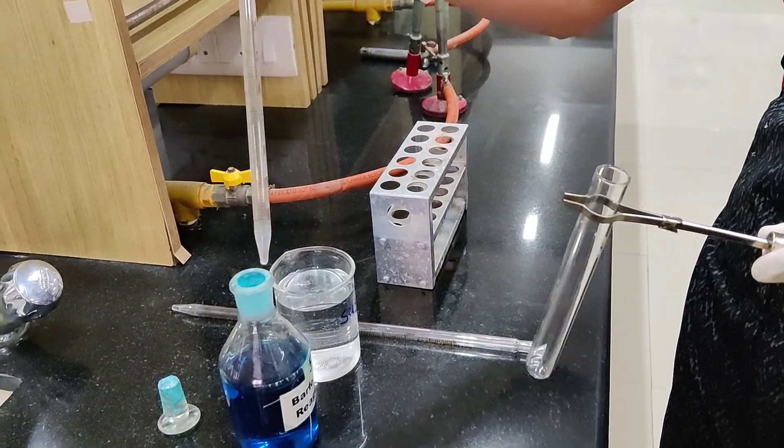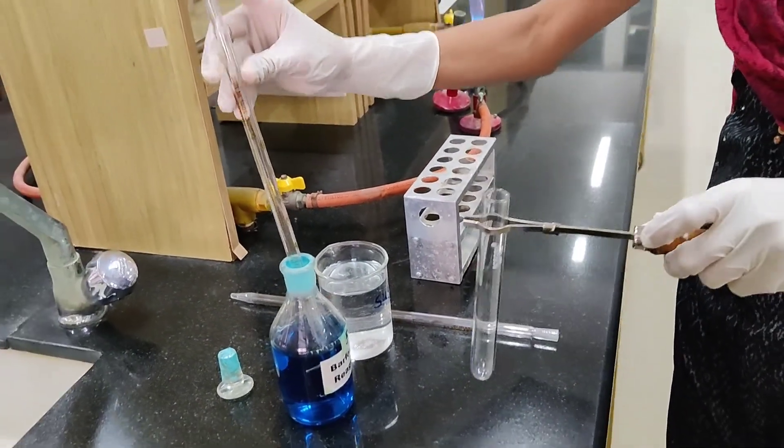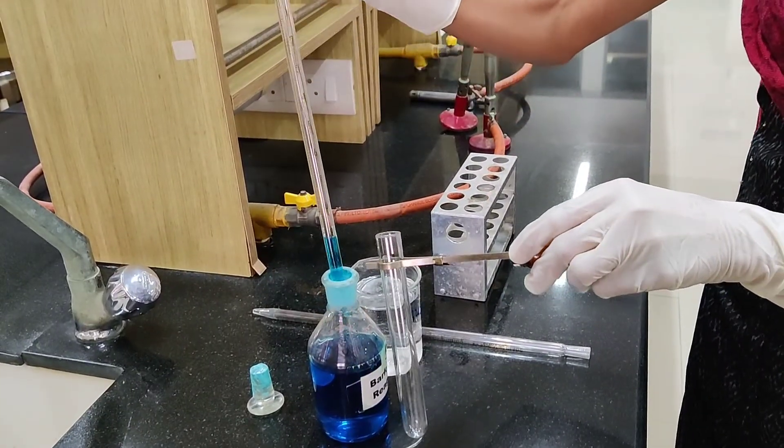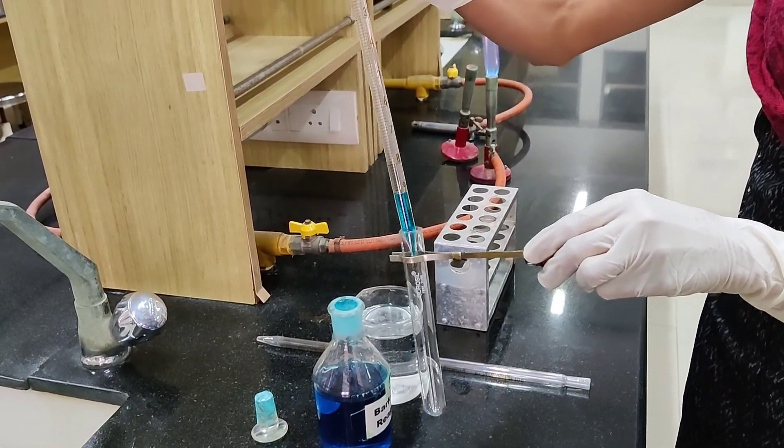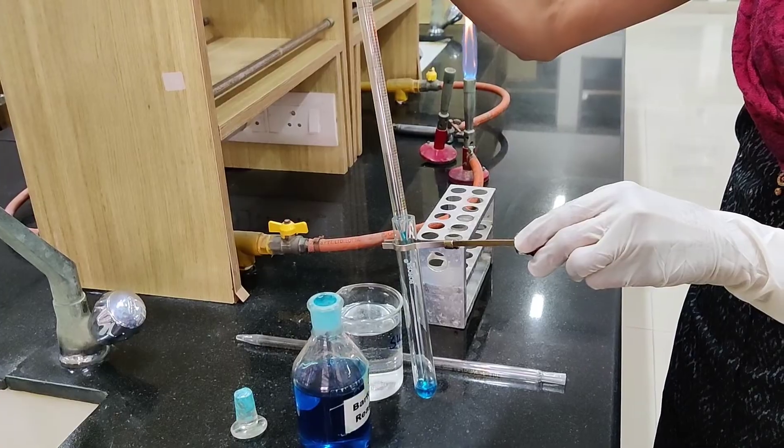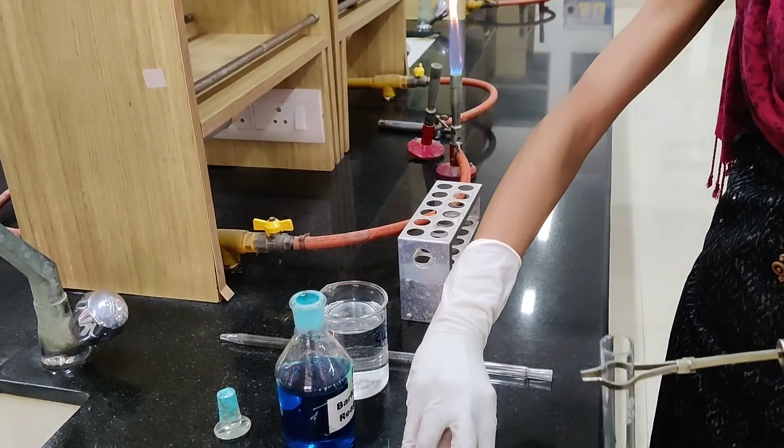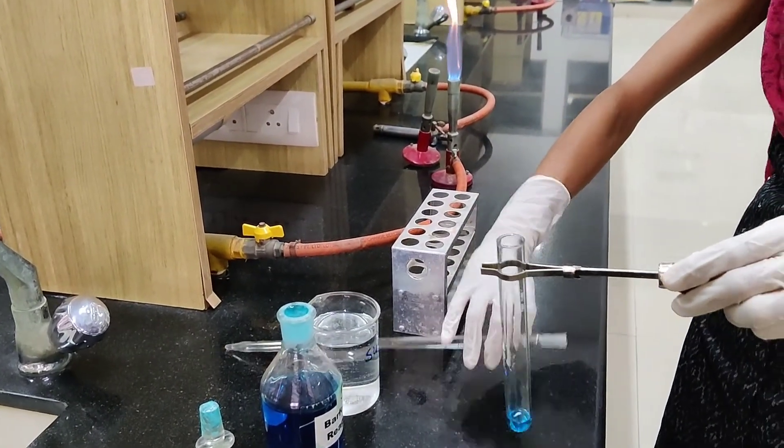First, take 2 ml of Barford's reagent in the test tube with the help of a glass pipette. After taking the Barford's reagent, add 2 ml of sugar solution in the same test tube.